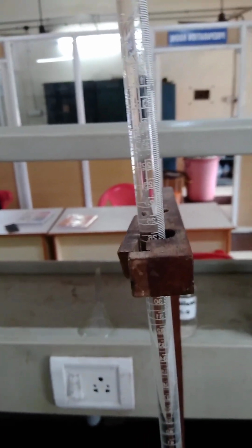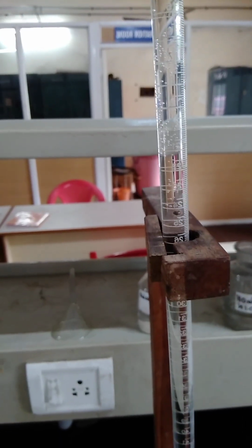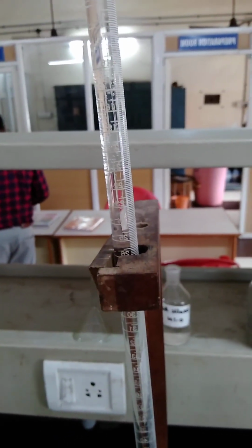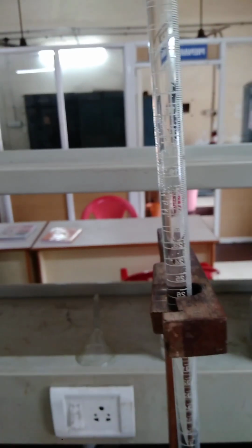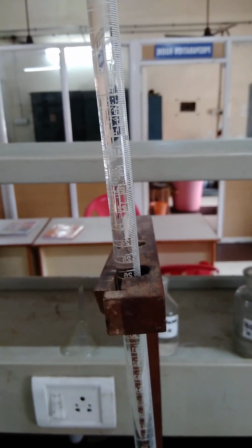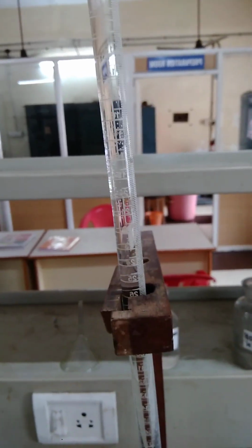So what do we mean by the concordant value? If 18.8 first time you got it, second time 18.9, then third time 18.8, it will not be considered a concordant value. Successive titration values are supposed to be the same. Then only we can call it a concordant value. So 18.8, 18.9, then 18.8, then you have to repeat once again to get the same value 18.8. Then it will be considered a concordant value.